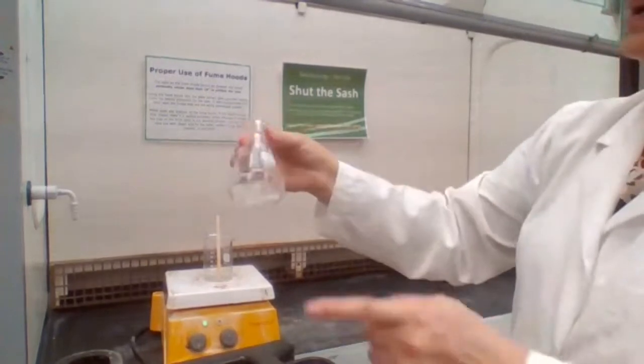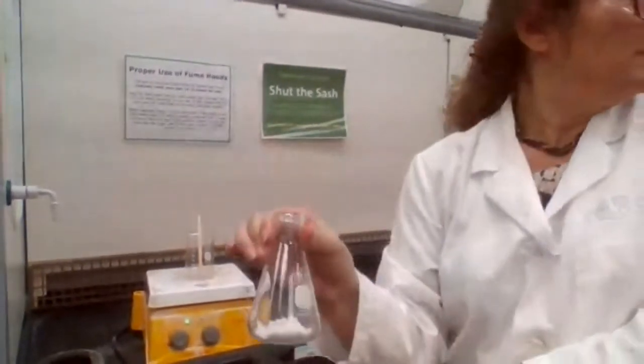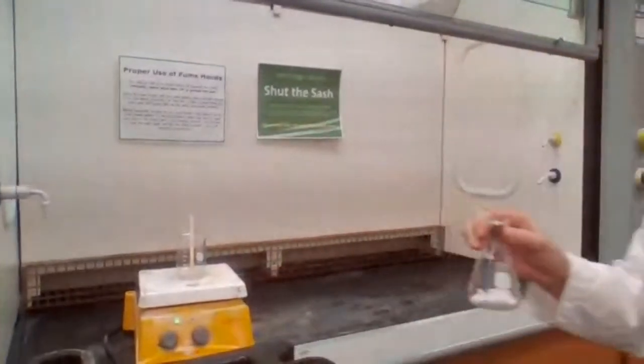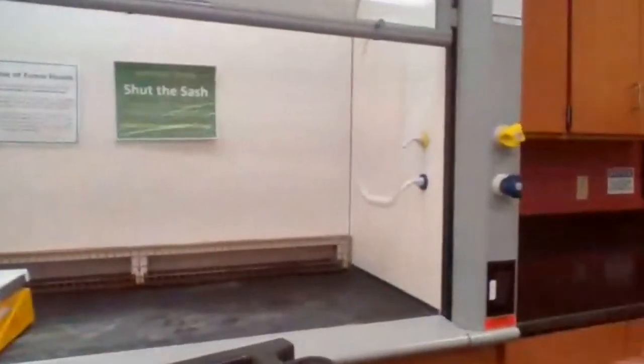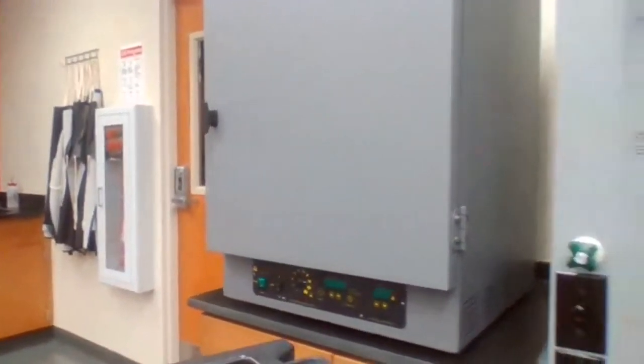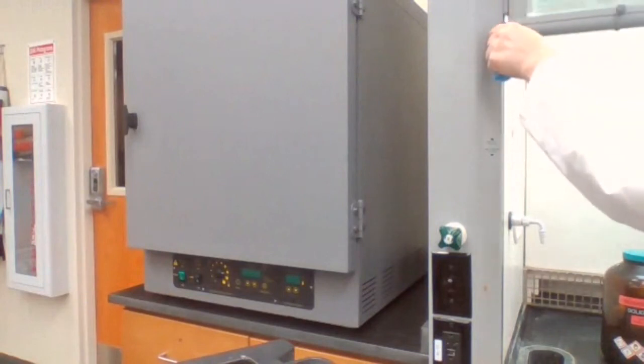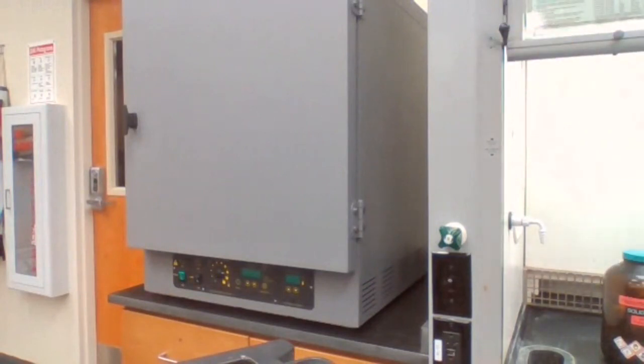This is going to the solid waste. So I'm going to dispose into the solid waste. And while that is boiling, for organic, I'm sure you were here already for your organic one, so you know where everything is. But we do have bottles for disposal: solid, aqueous, halogenated, and non-halogenated.